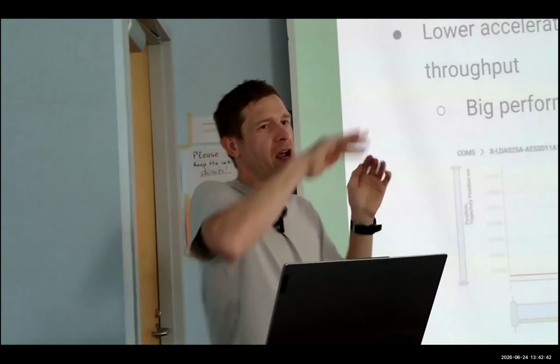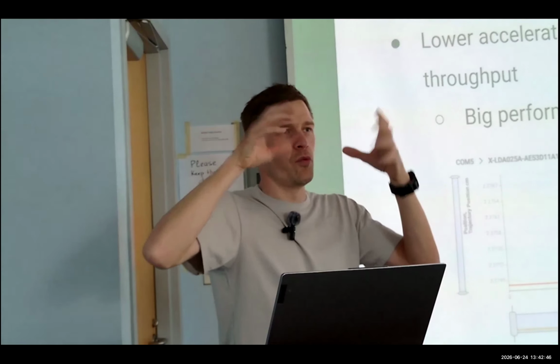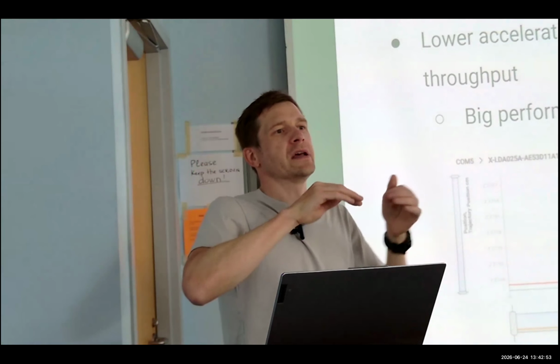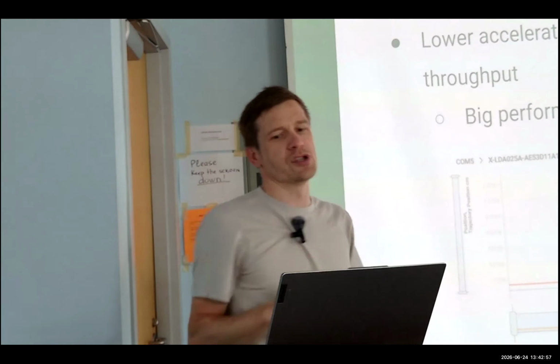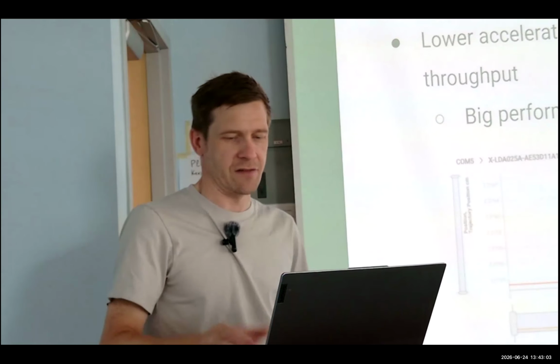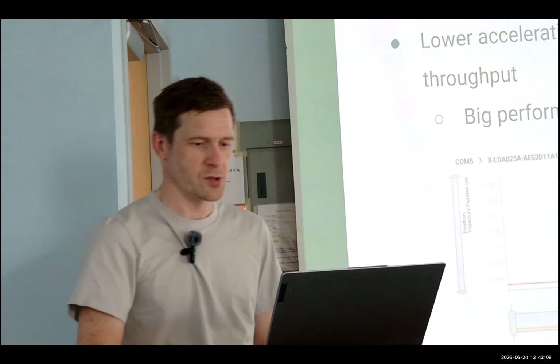These tools will help you figure out, based on how your system is built and the stiffness and the load you have on it, exactly how hard you can drive it before you start overshooting and impacting your settling time. I highly recommend using those tools, this is the Zaber oscilloscope tool.